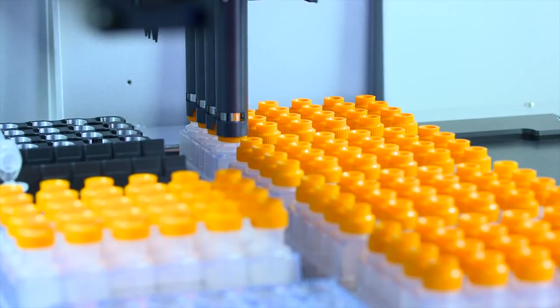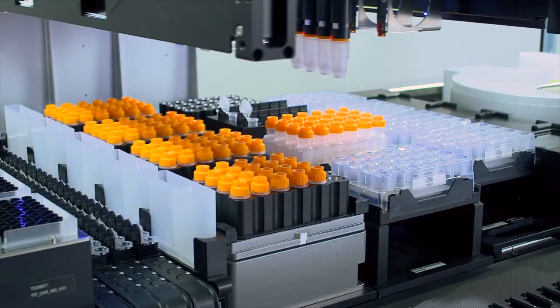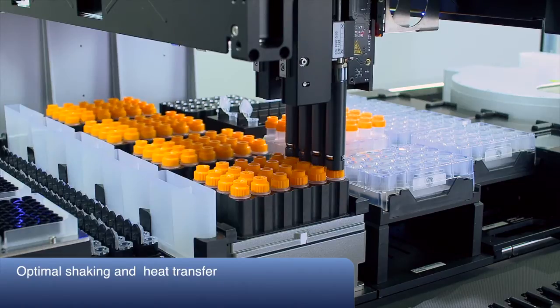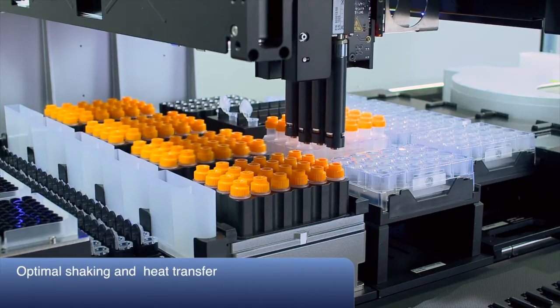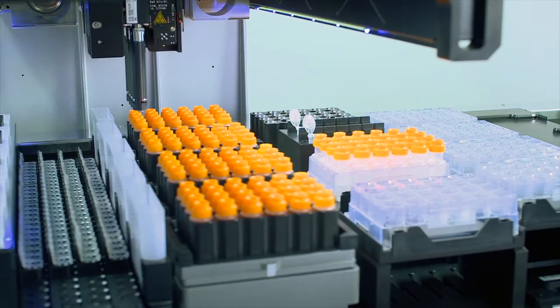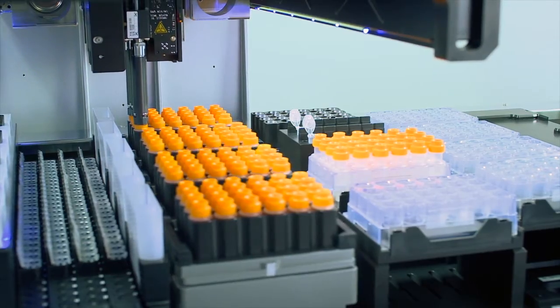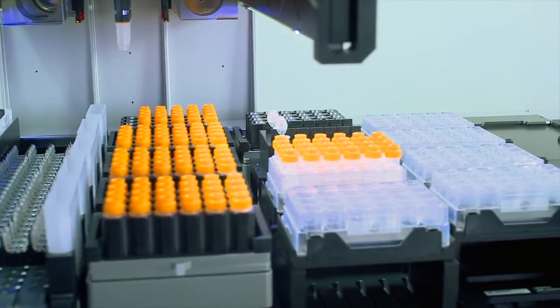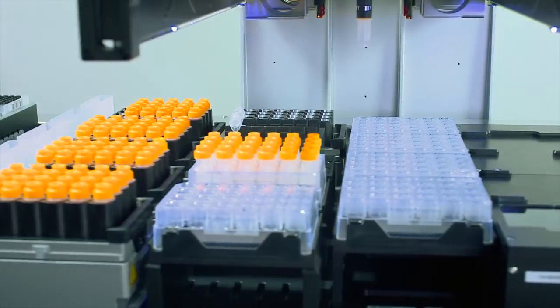Autolis channels will open and close the inner tube to allow the addition of reagents like lysis buffer. These same channels also transport tubes individually to a heater shaker, specially designed to offer the best heat transfer performance during the lysis incubation time. After lysis incubation, the shaking stops and the Autolis channels transport tubes back to their original position in the Autolis racks on the robot deck.